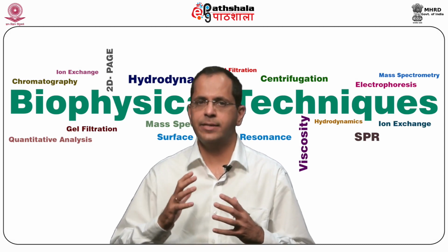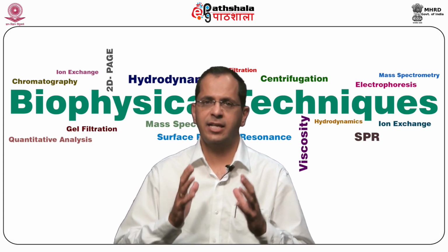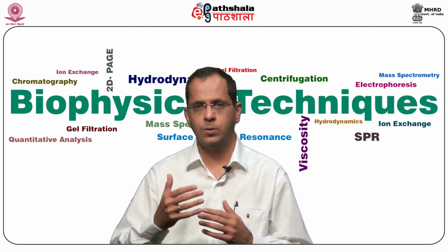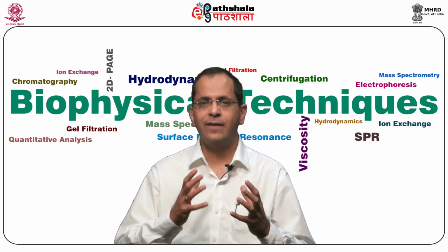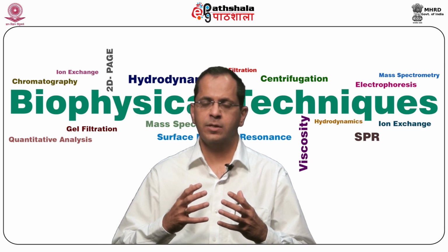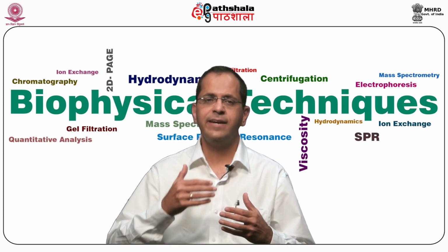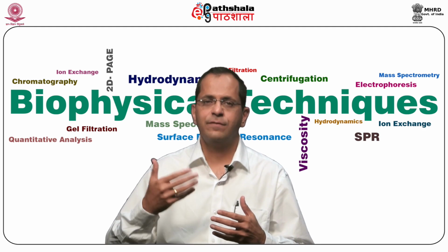So, what are the important aspects of clinical proteomics? The most important thing to start with would be the patient selection, which is to be stringent with specific criteria. Then you have the protein sample preparation, which includes collection, processing, storage, and experimental use, and these have to be defined by specific guidelines and protocols. The choice of the tissue is different for different research questions and depends on the feasibility and patient compliance. And you need ways to tackle high abundant proteins and the salt before you can proceed with certain few other proteomic experiments.